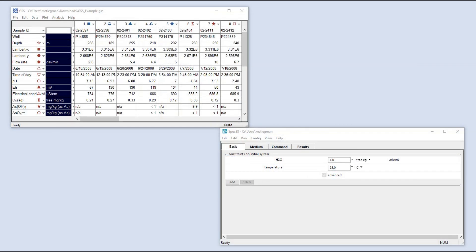You can move data or samples between GWB applications by performing a right-drag, which is just like a left-drag, except you press, hold, and drag with right-click instead.